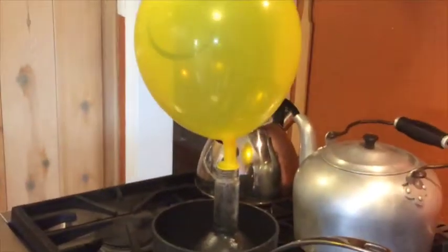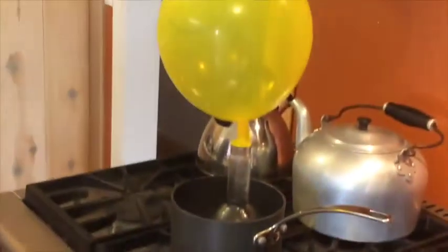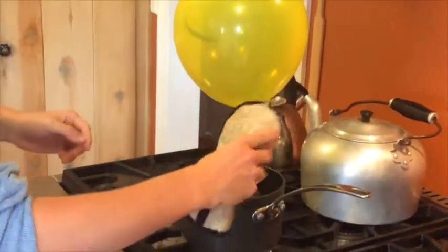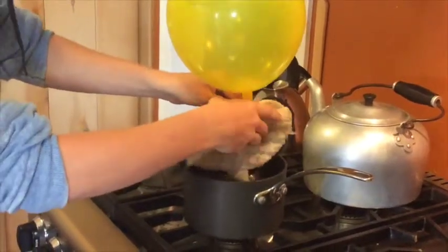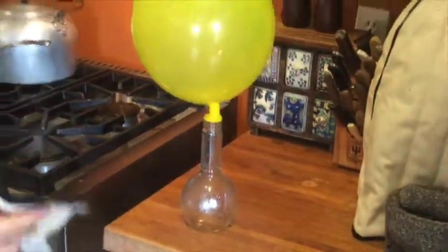I think we should stop. All right, so now we can turn off the heat, and carefully, with a set of heat gloves or another heat item, try to remove the bottle from the water and place it on the counter for observation.